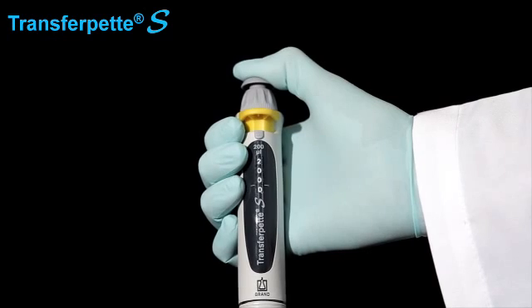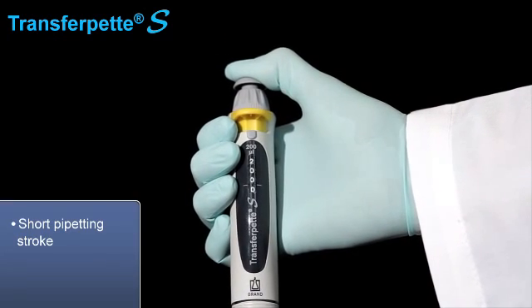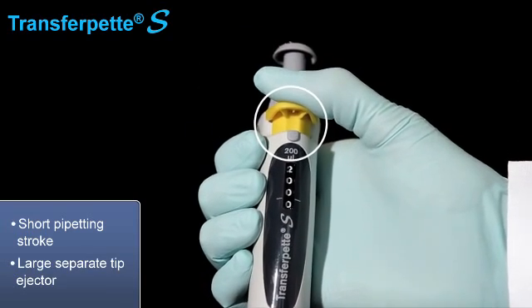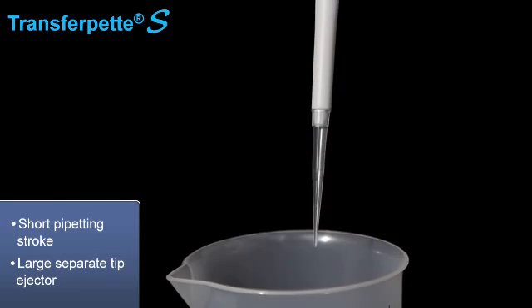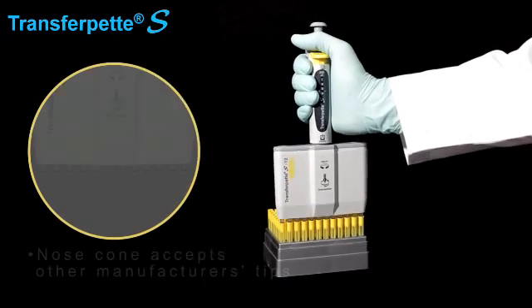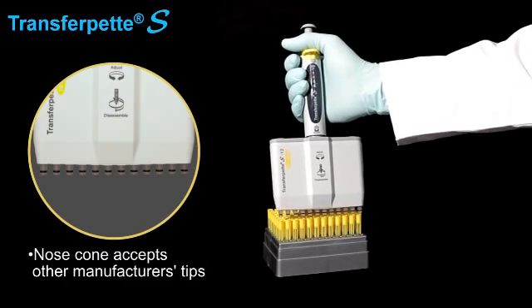The instrument offers a number of user-friendly features including a short pipetting stroke which reduces fatigue. A large separate tip ejector reduces the amount of force needed, enabling easy tip ejection. The instrument's nose cone is designed to accept tips made by other manufacturers.